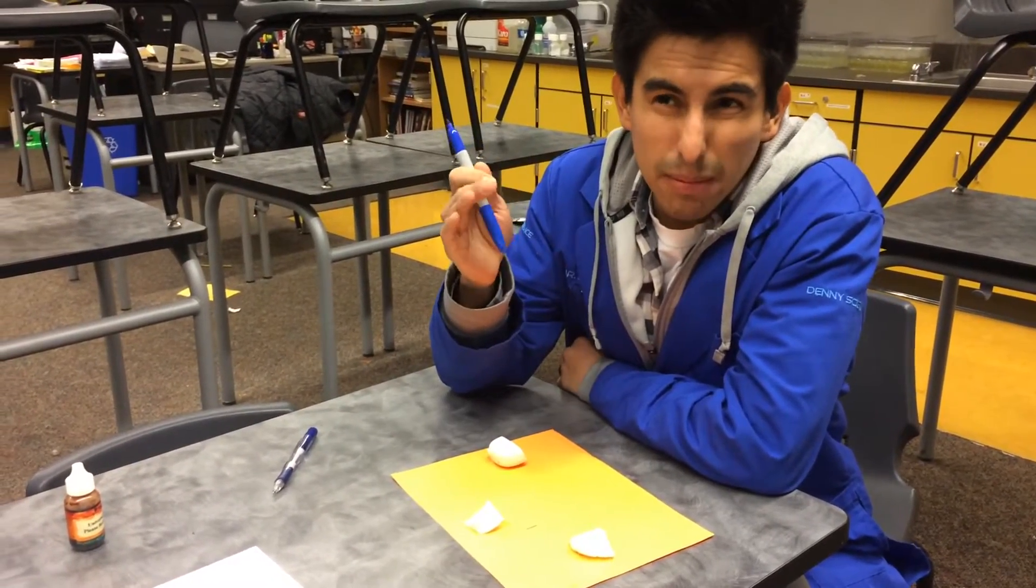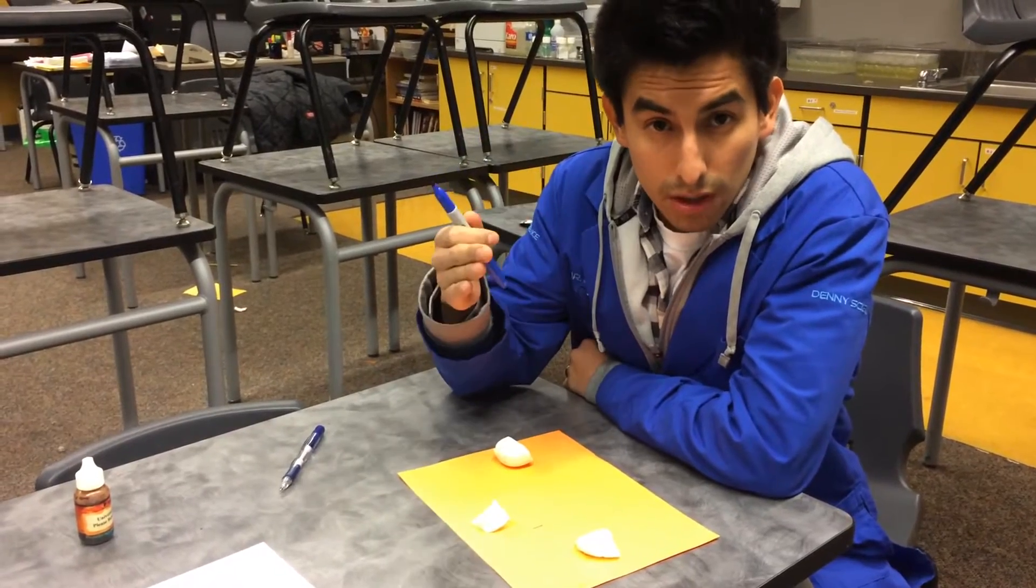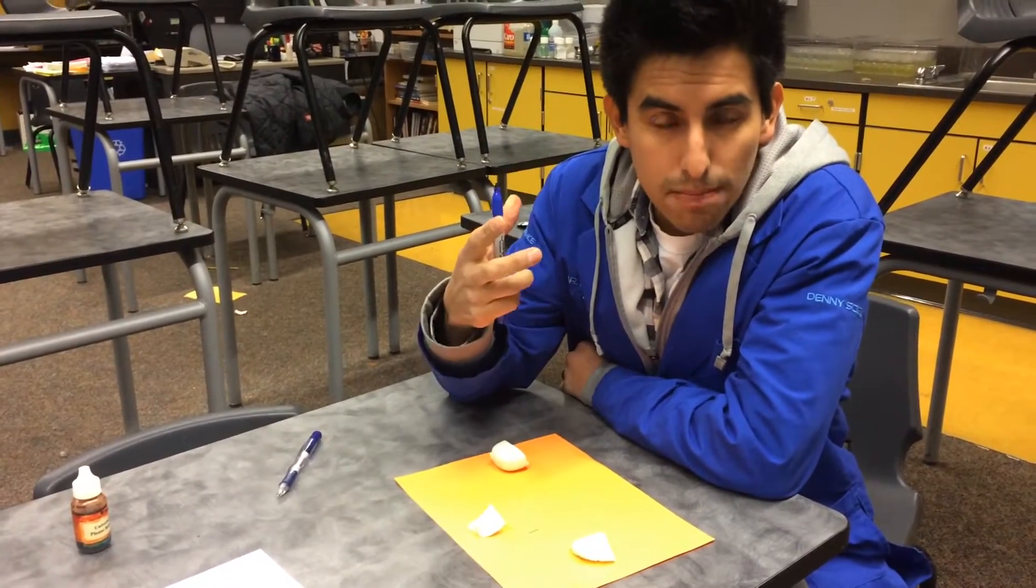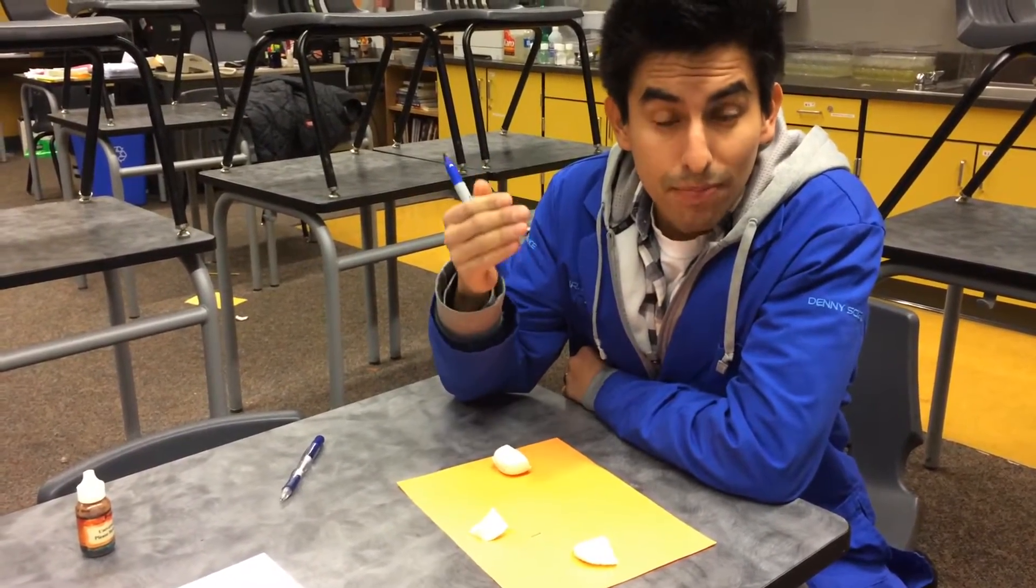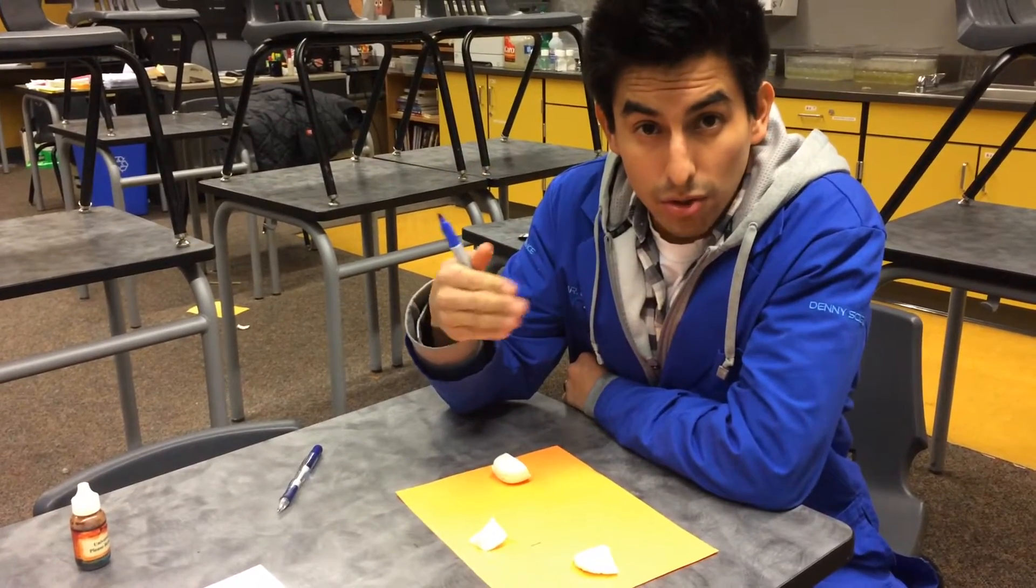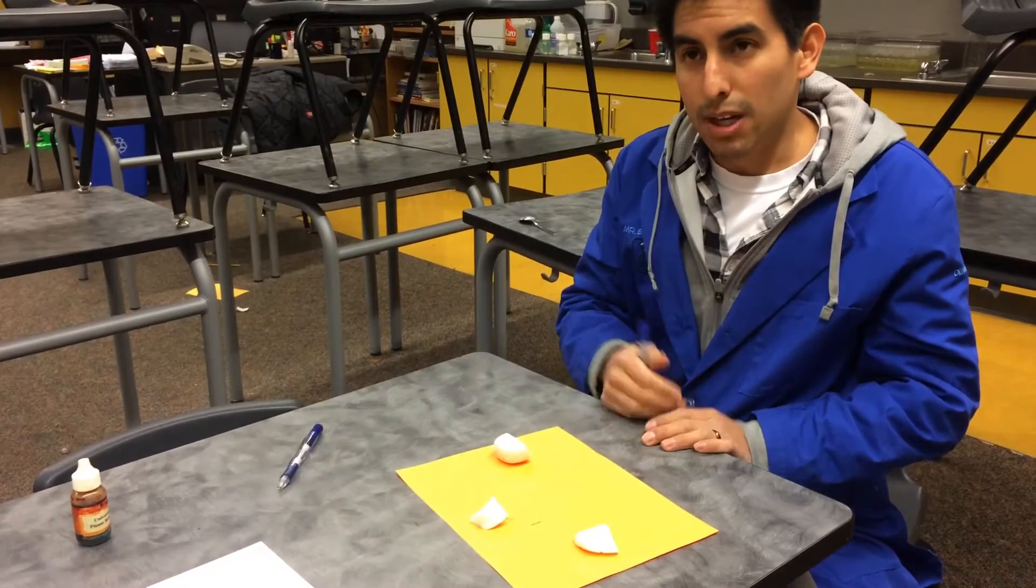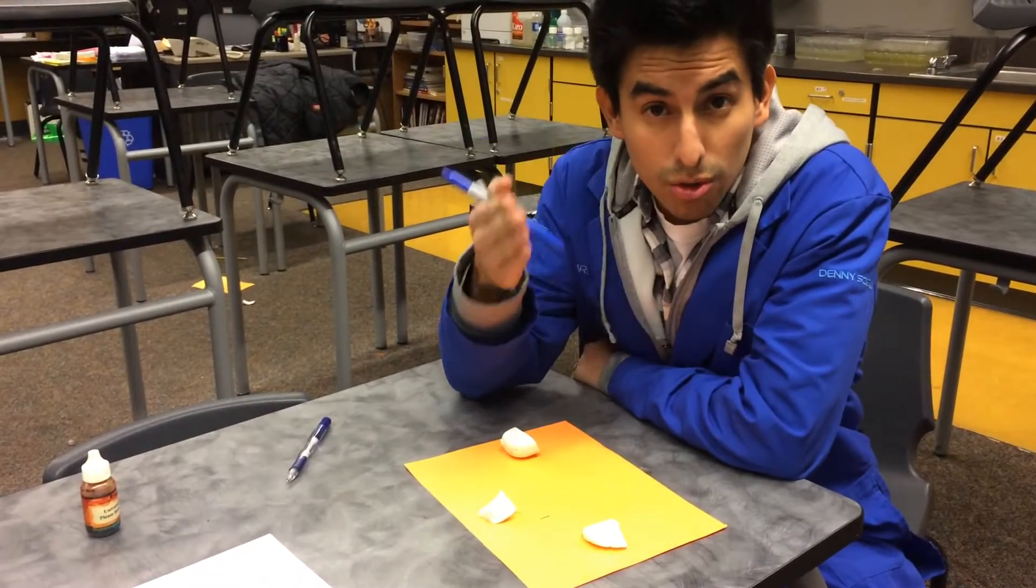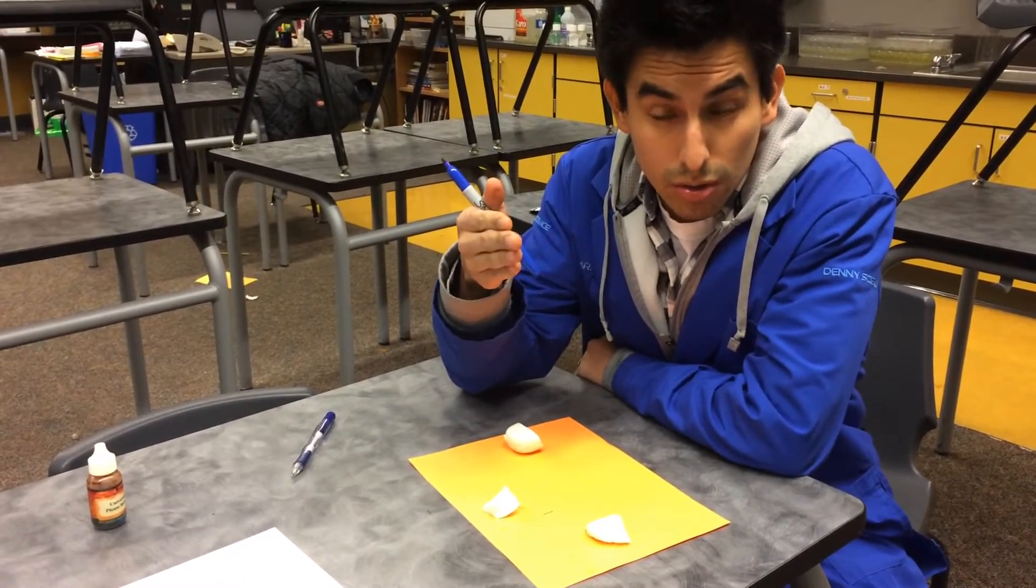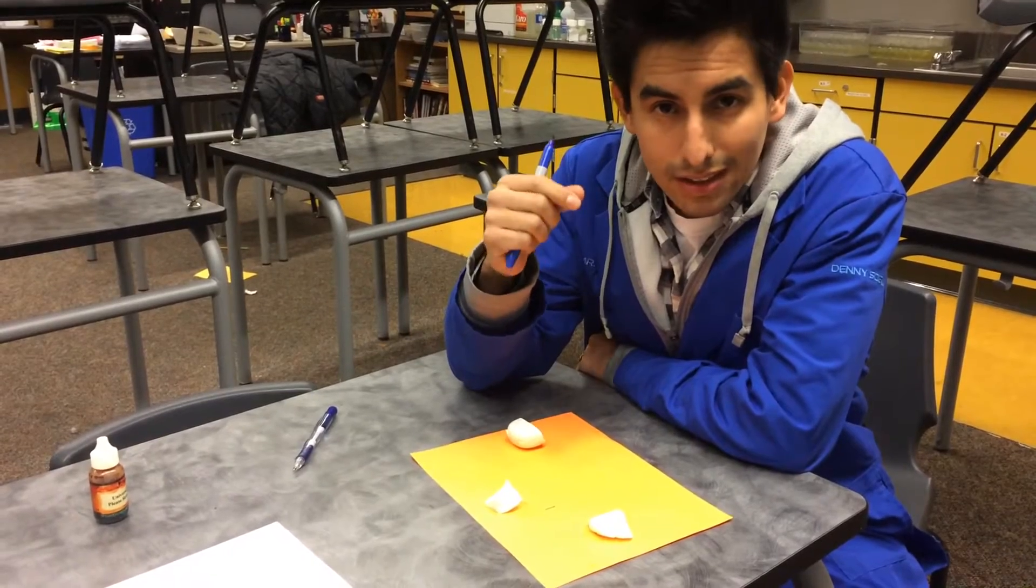So back, let's say maybe two or three weeks ago, we looked at the food truck. We tested the blob and we tested the soap and the lard to see how it dissolved in alcohol and water. So I got a couple samples, a couple things that happened as I looked at your results and Mr. Evans looked at his results too. A lot of the things were inconsistent.